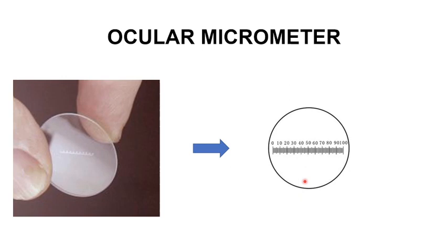almost 100 divisions are present on this ocular micrometer, but we do not know the distance between one division, I mean two lines, or across the whole 100 divisions of the ocular micrometer. So we first need to calibrate this ocular micrometer.